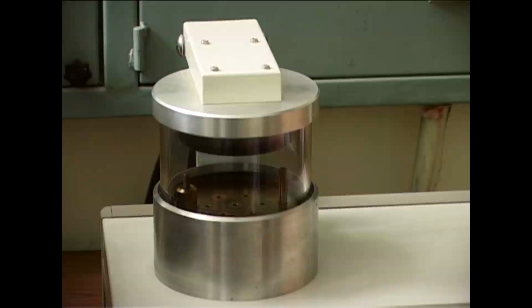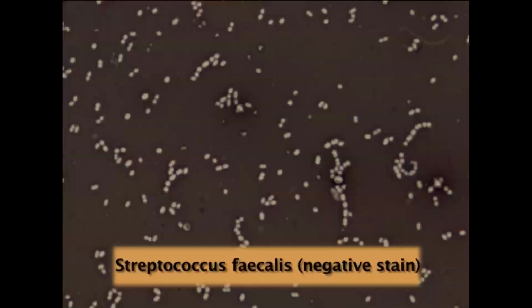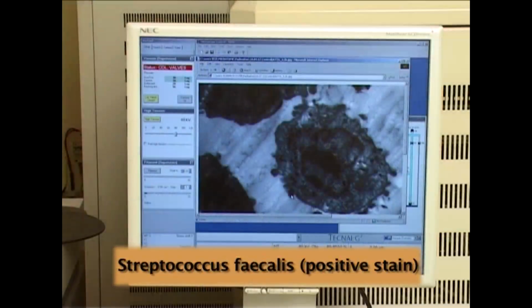In the case of some biological specimens, other types of sample preparation can also be done. One of the examples is negative or positive staining. In positive staining, lead acetate or uranyl acetate can be used to stain the sample per se. However, in negative staining, we actually stain the background and not the sample. So, contrast is enhanced for some objects.